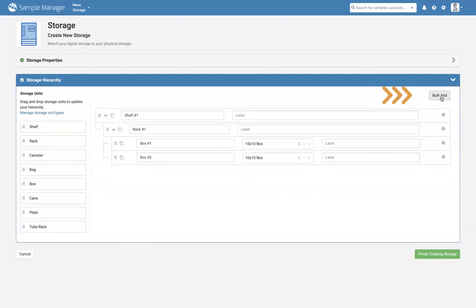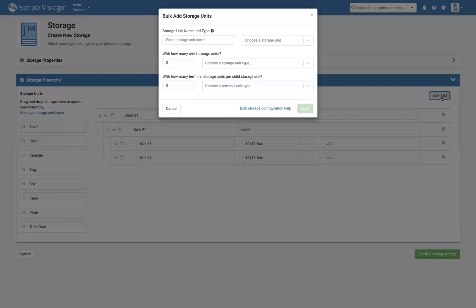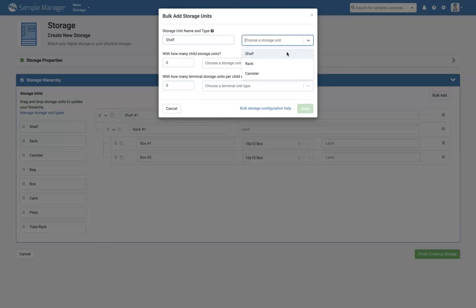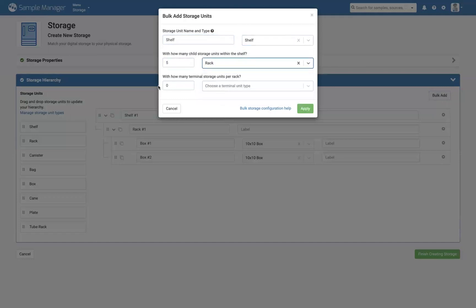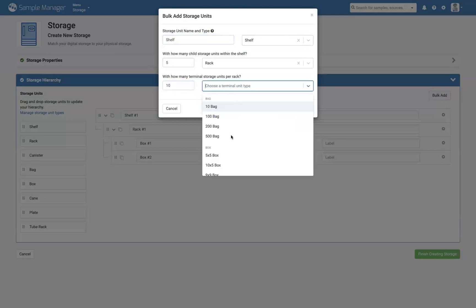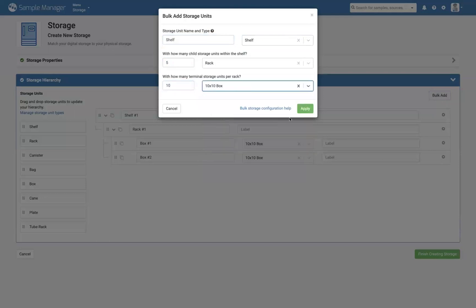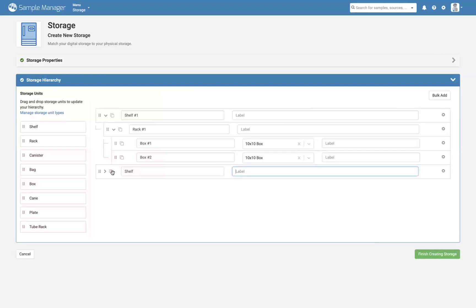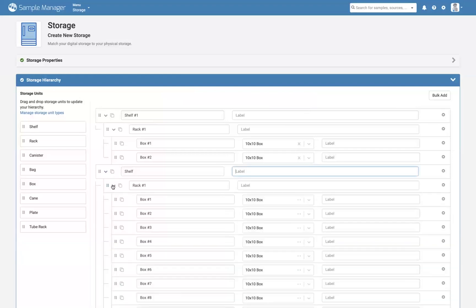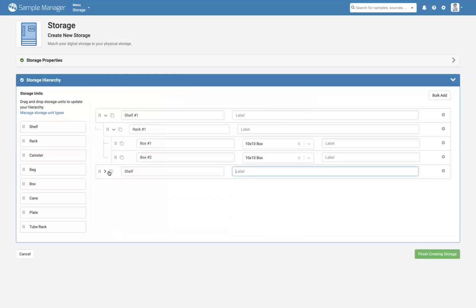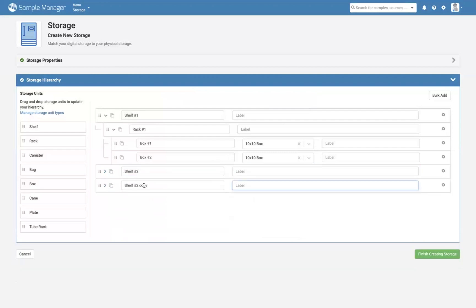If you have a very structured freezer like a liquid nitrogen tank or an ultralow, you can select Bulk Add. Indicate the levels and box sizes and select Apply. For example, I've created a shelf with 5 racks and 10 10x10 boxes in each rack. I can use the Copy icon to copy the shelf hierarchy within my freezer.